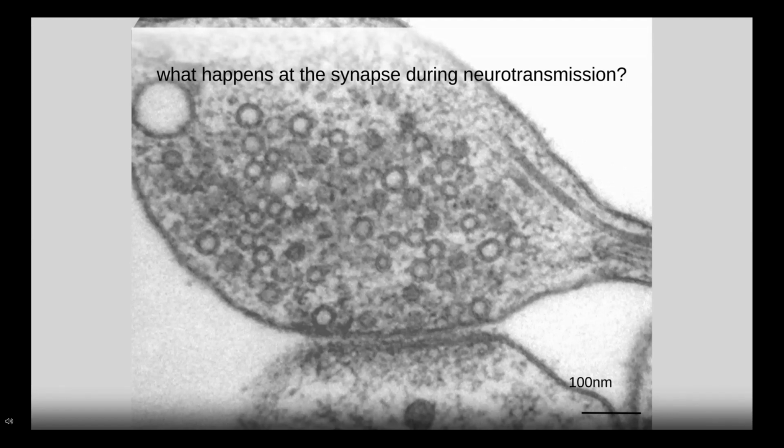That's really just because everything is very, very small. Looking at it here, the entire presynaptic terminal is only about a micron across. Synaptic vesicles are 40 nanometers in diameter and tightly packed together. And all these fine structures, synaptic vesicles getting close to the active zone, vesicles fusing, things endocytosing in the presynapse, all this is at a nanometer scale, really only accessible to electron microscopy under most conditions.